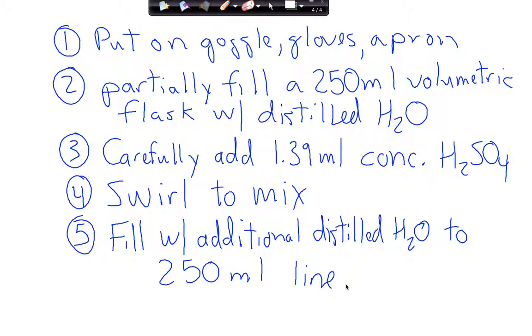In addition, there's a lot of water in here to soak up the heat that's being released as the acid reacts. Now imagine if this was full of acid and you dumped in water and that went. Most of what's coming out will be acid. So guys, you always start with a lot of water and then add acid to it. So you always add acid to water, never water to acid.